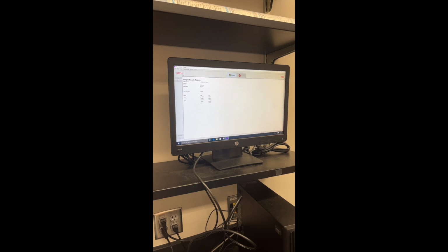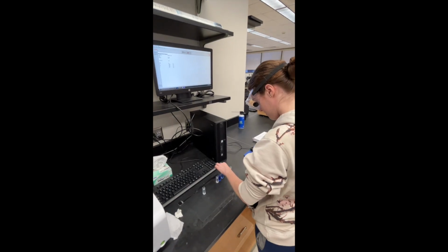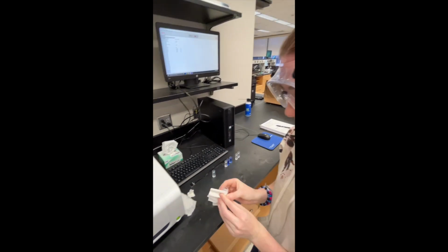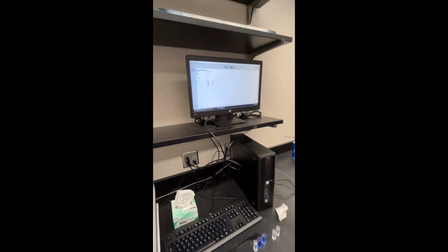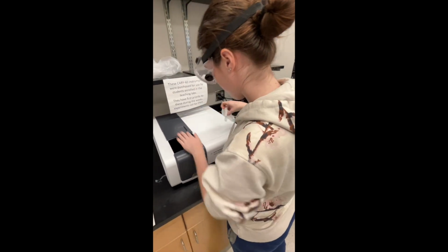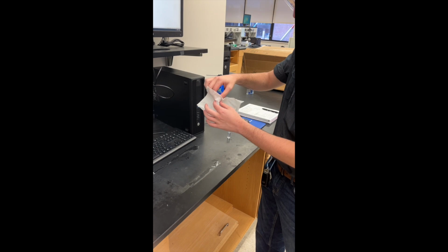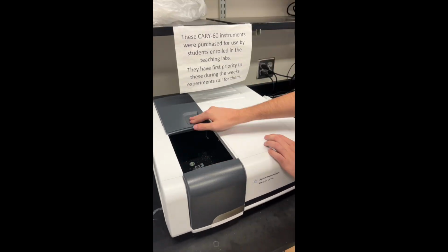For this cuvette, we will scan across all wavelengths for 2 reasons. First, we scan across all wavelengths in order to observe how the absorbance changes across every wavelength. Secondly, we scan across the wavelengths to find lambda max, or the wavelength where absorption is highest. With the peak absorption of the stock solution, we record the wavelength that corresponds with it.